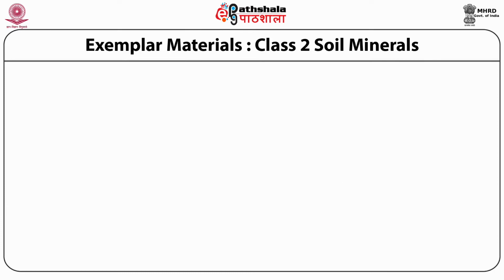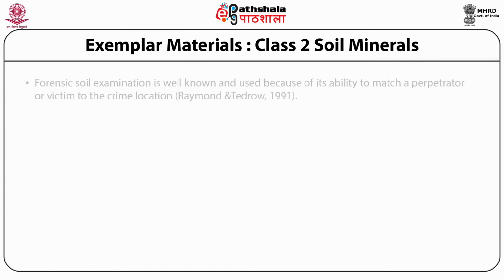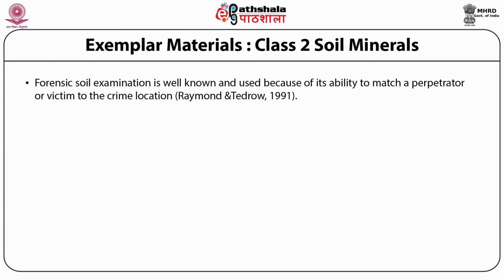Class 2, soil minerals. Forensic soil examination is well known and used because of its ability to match a perpetrator or victim to the crime location.